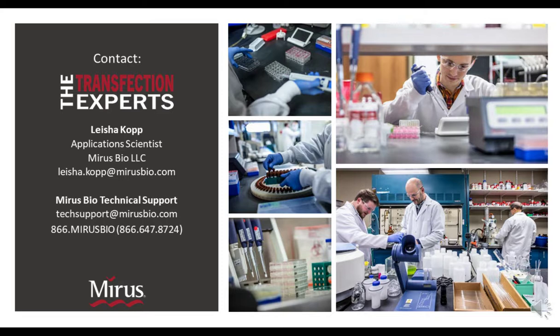It's something that we do want to look at a little bit more extensively for those longer complex incubation periods, because if you think about how complexes form with negative and positive charges, if they're more concentrated, they're going to form more quickly. And so we still need to establish the length of that window, but say you only need a half hour, that should be also perfectly fine to do.